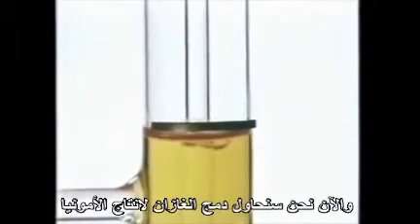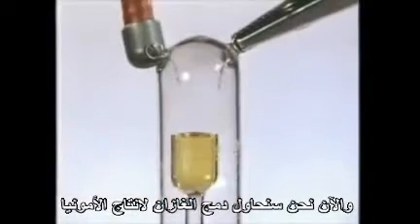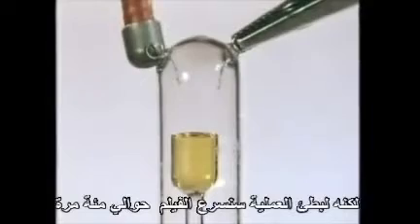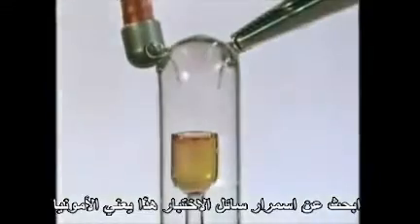And now we'll try to combine the two gases to make ammonia. Between the two metal electrodes at the top, we apply a very high electrical voltage. You can see a spark if we dim the lights. Around the spark, there should be a high enough temperature to make the two gases combine. But it's a slow process, so we'll see the film speeded up about a hundred times. Look for a darkening of the test liquid — that will mean ammonia.